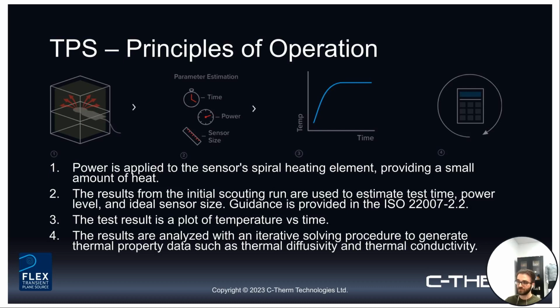So there's this verification process. It stems from guidance that's provided in the ISO standard. But essentially, there's about 6 or 7 of these checks that you need to run through in a standard measurement. Some of these are quite quantitative in nature, so certain criteria just simply have to be met through a calculation that is run. Others are more qualitative. Certain trends in the data, certain properties of the results that are generated need to be investigated. But ultimately, there is, you can call it, a roadmap that's set out for you that we, of course, provide training on. And again, you'll be able to follow this through and verify your test data, make sure it is, in fact, correct.